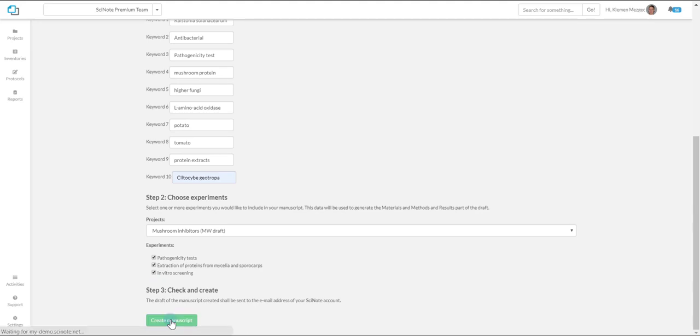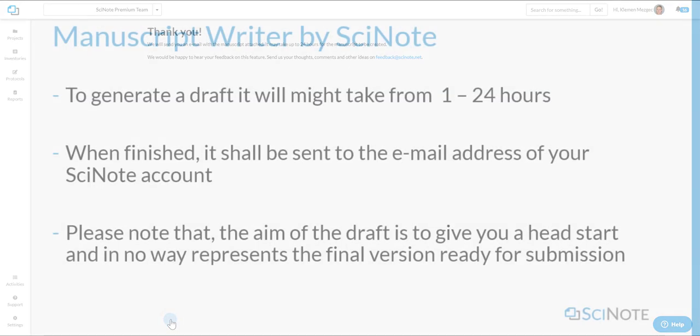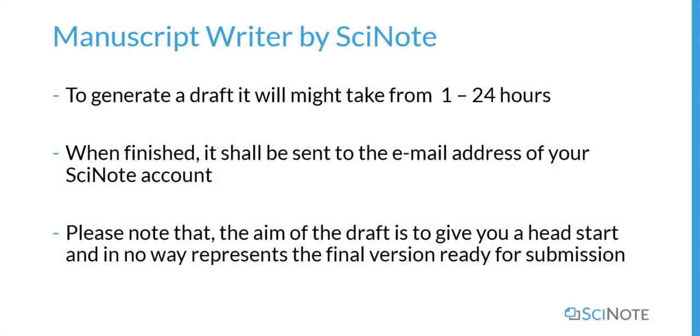To generate a draft, it might take from 1 to 24 hours. When finished, it shall be sent to the email address of your SciNote account.